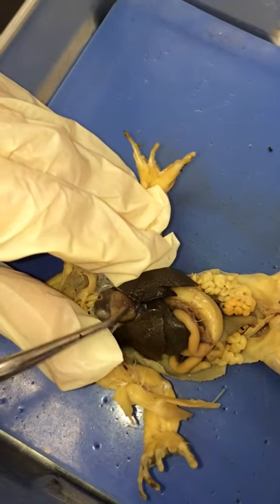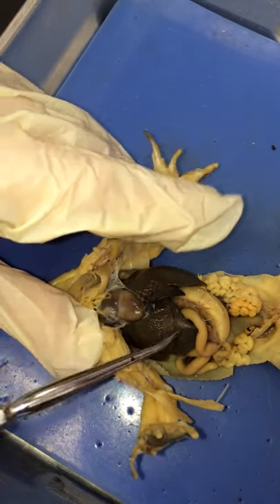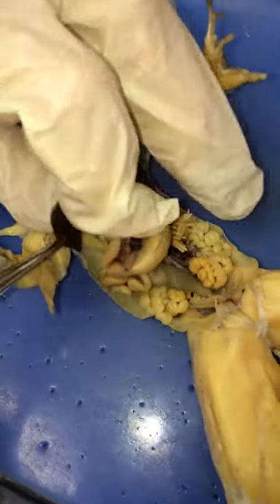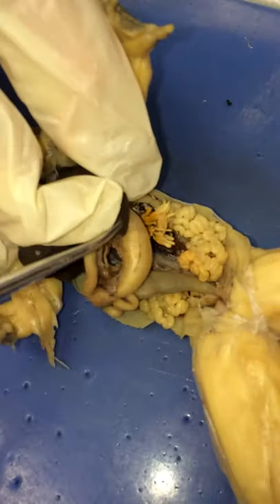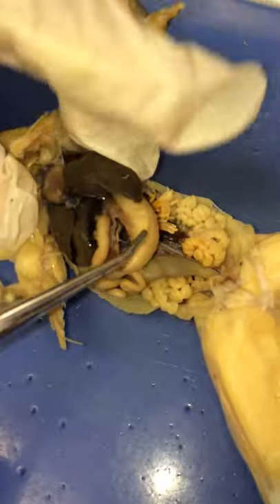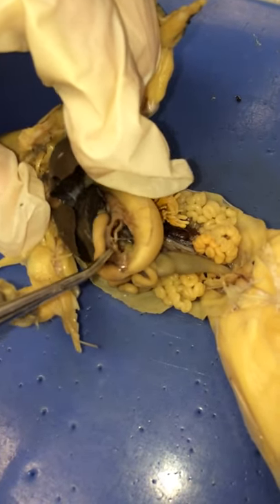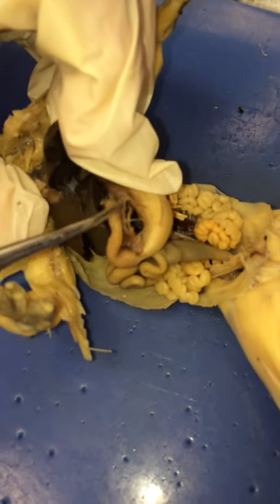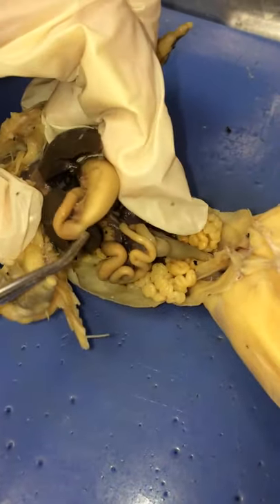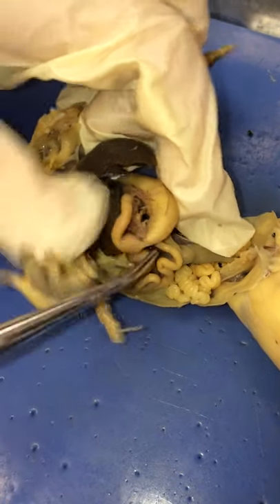Here's the ventricle, the left atrium, right atrium, three lobes of the liver. Under the liver is the gallbladder. Here's the stomach, and in between the stomach and the duodenum right here is the pancreas. Yours looks like it's chewed up a little bit, but there's the pancreas. Here's the pyloric sphincter, the very end, the duodenum — first part of the small intestine.